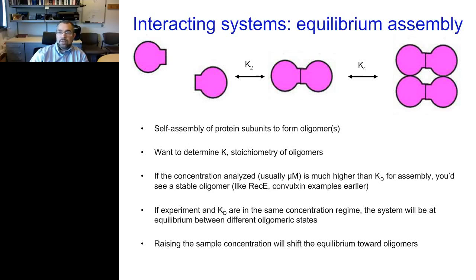All right, in the time I have left, I'm going to talk about some more of the interesting details, and I will necessarily need to go relatively fast through these. But in addition to initial characterization, AUC is a wonderful technique for really delving into the finer details: the quantitative aspects of protein assembly or protein-ligand, protein-protein interaction, stoichiometry, and really getting at things like accurate equilibrium constants.